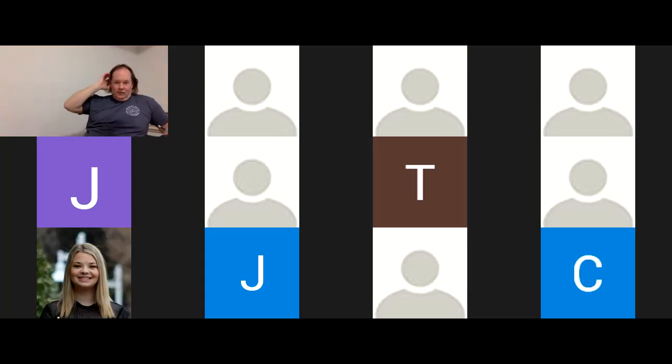The hoods are usually a real roar. During Quant Lab, we usually set the hoods to high flux to try to keep a clean atmosphere in there. Or maybe you want to come in with your buddy and get benches close to each other. There are 4 big benches, and we're going to have 3 per bench, 2 on one side, 1 on the other. Then the next bench goes 2. That's our social distance arrangement.